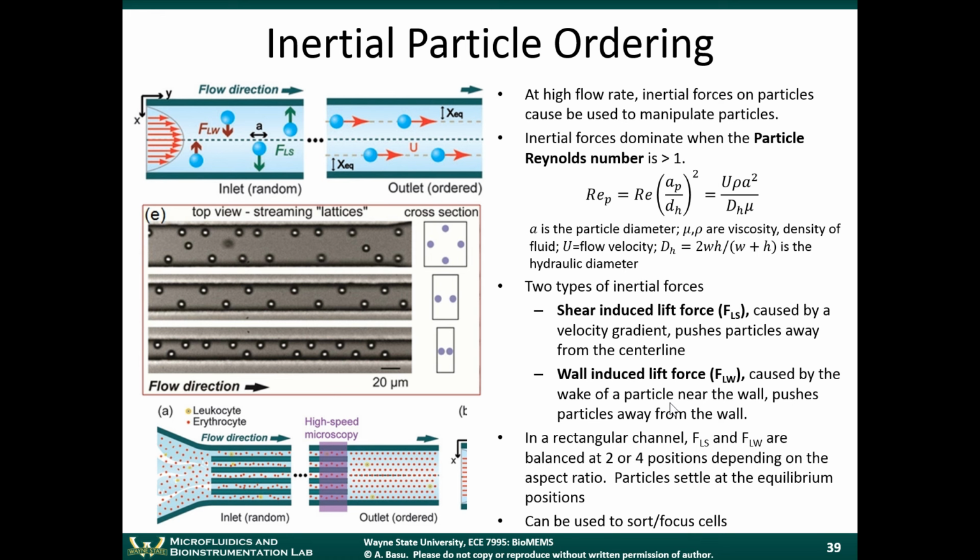This set of techniques relies on inertial forces. This is getting to what Jeremy was talking about. At high flow rates, inertial forces on particles can be used to manipulate the particles in the flow. So the inertial forces dominate when the particle Reynolds number is greater than 1.